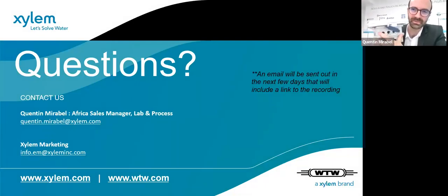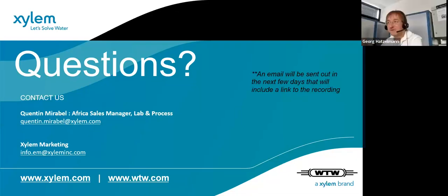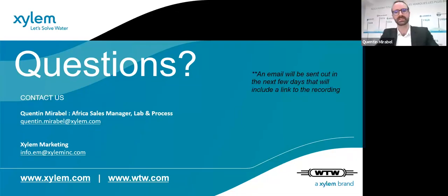We have a USB connection as standard on the terminal, and you can transfer the logged values. You can also use the USB port for software updates that are available on our website on a daily basis. So yes, we do have a USB port.